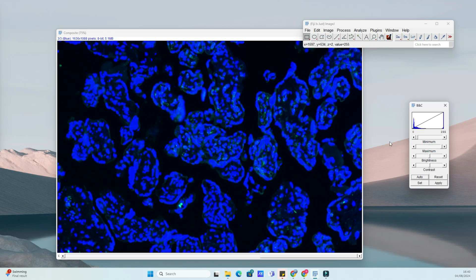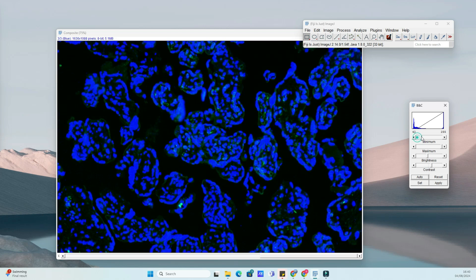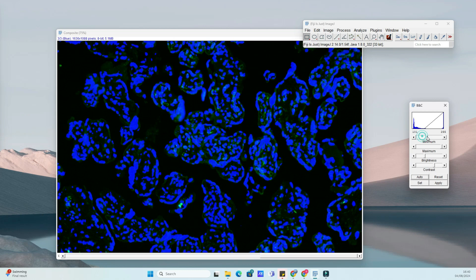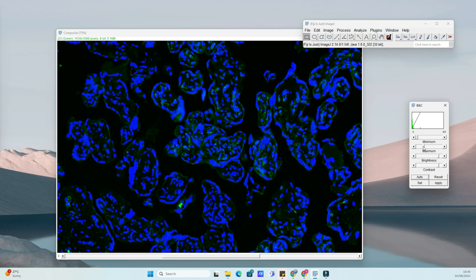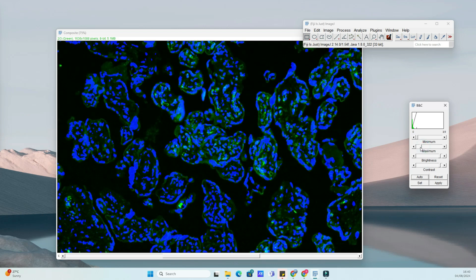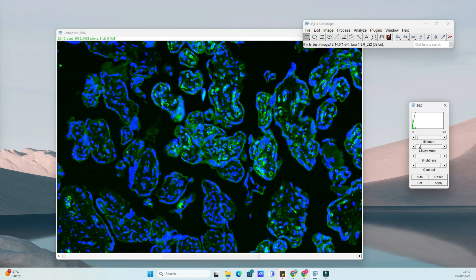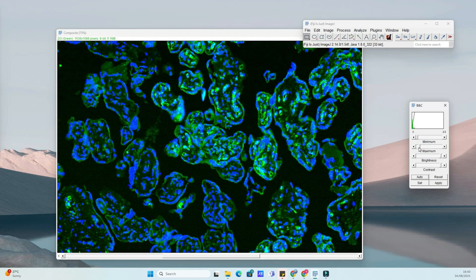After merging, you might need to adjust the brightness and contrast to enhance the visibility of the merged image. Go to Image Adjust Brightness Slash Contrast. Use the sliders to adjust the brightness and contrast until you achieve the desired visualization. Click Apply when you're satisfied with the adjustments.